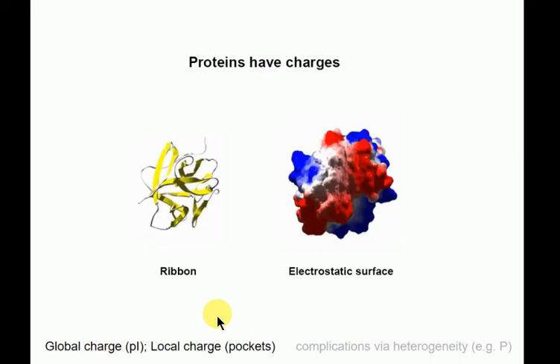And I've mentioned those complications you get via post-translational modification. So the big one, if your protein is heavily phosphorylated, it's obviously going to be more negatively charged. If it's methylated on the arginines, it takes away the positive charge. You know, other things can affect the charge by being modified.